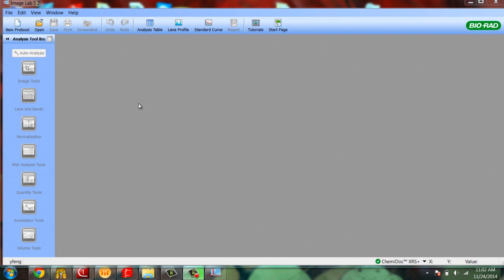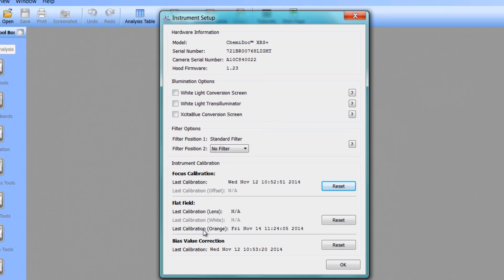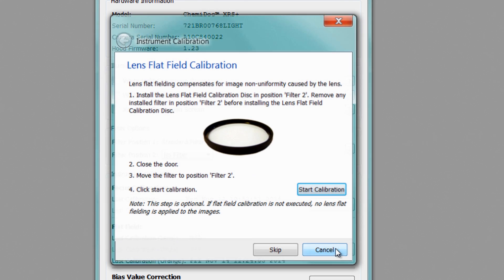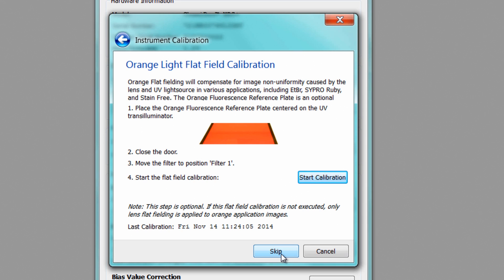To begin, navigate to the Edit menu of the ImageLab software and select Instrument Setup. Locate the flat field section of the Instrument Setup window and click Reset. Next, click Skip to bypass the lens flat field calibration step. This calibration was performed during initial instrument installation and does not need to be reset.